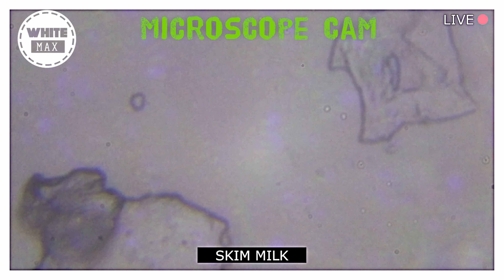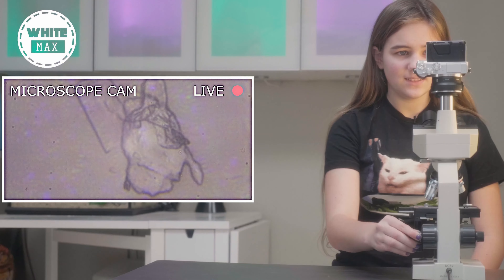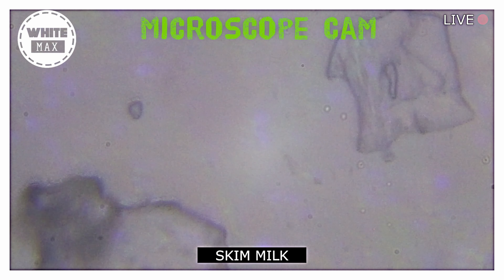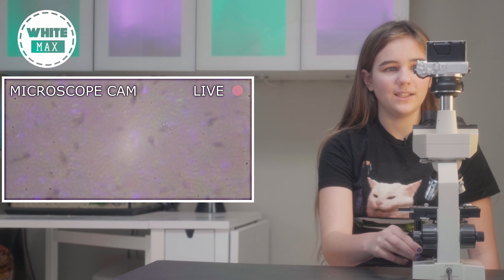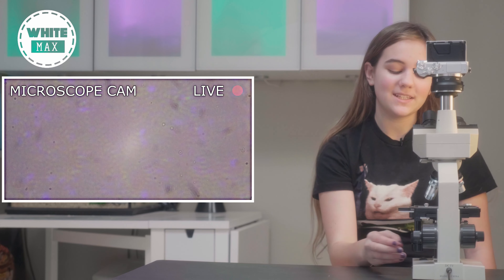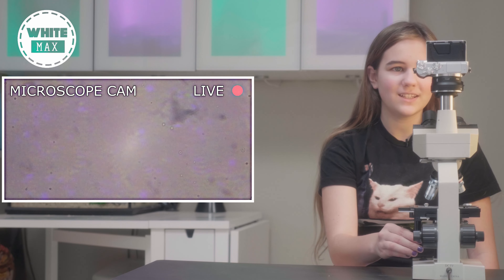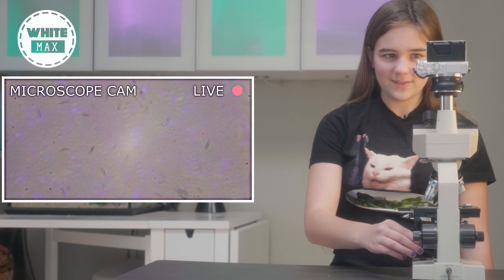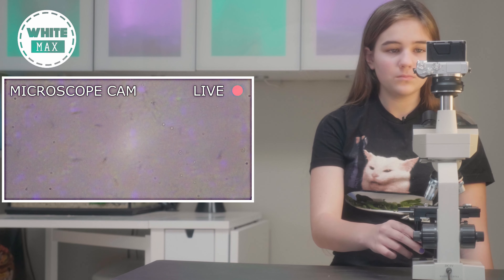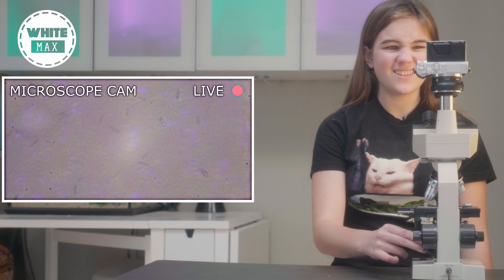They're big things. That is quite big actually. I don't even know what that is — it's just a big chunk. Chunky chunk. There are like lots of little tadpoles or something — they are not tadpoles, but they just look like it. They look like very tiny fish. And there's a V here — it looks like Victini, like the Pokémon. So in the white zone, we can see that it is just white, and then all the little bubbles that we saw earlier have turned into lines. They look a little bit like hairs. It's kind of gross.